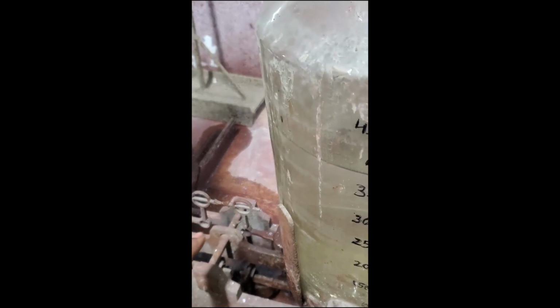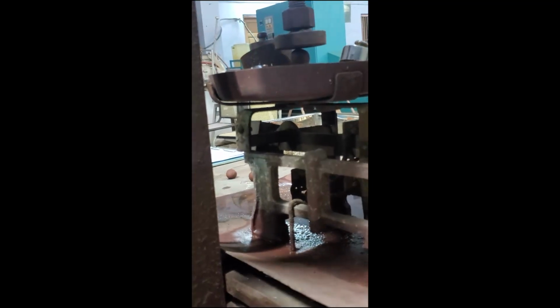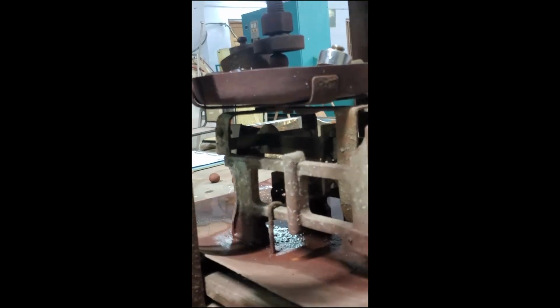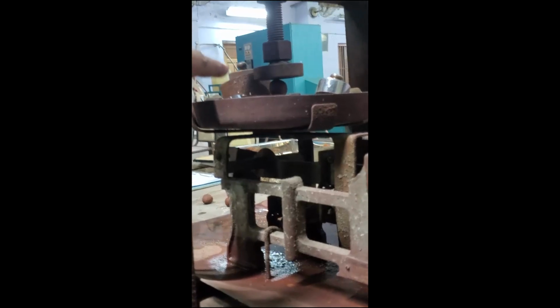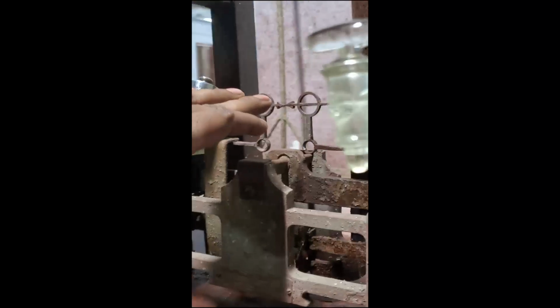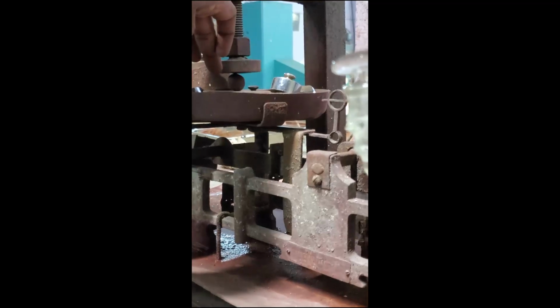The first step is we have to equally balance, and the second step is we are placing the green pellet between the head and the platform. Now from the head we are making it down. We want to touch the pellet. Now it is touched. So this is the procedure. First, initially we have to balance this pan balance, and after that keep this green pellet, and the head we have to make down so that this top plate will touch the pellet.